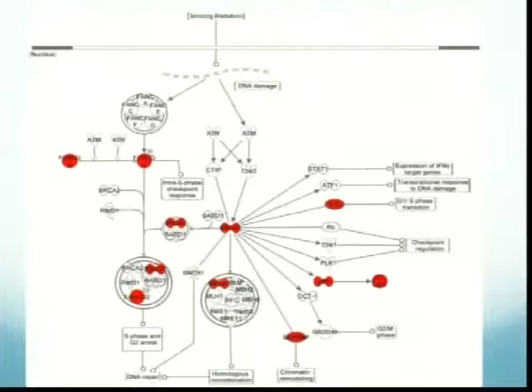But nonetheless, you can do it. So here's an example. This is an output from the IGV browser. Are you familiar with IGV? Yep. Here we're in this gene, keratin 17. Here we have a T mutation that's different from the reference genome. So we did this, and we call these mutations, and then we put them into a pathway approach.